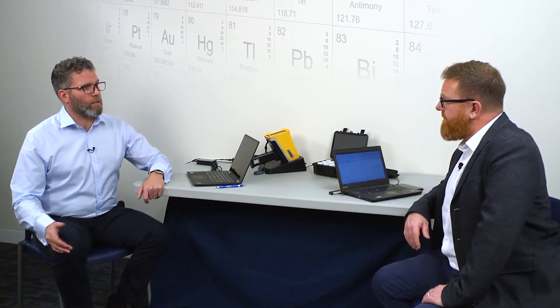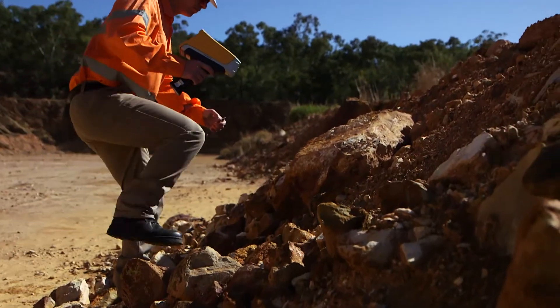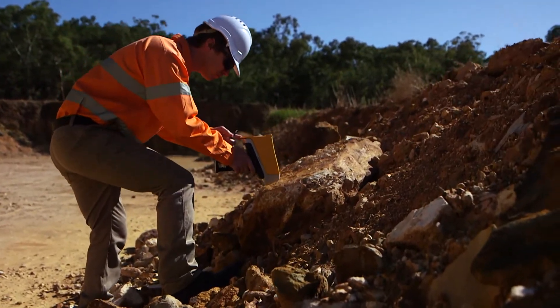So Todd, I'd like to start the discussion about what is actually impacted by test times when using your field portable XRF. It's mainly in relation to precision and lower limits of detection. It's all about statistics. The X-rays are gathering hundreds of thousands of points of information per second.